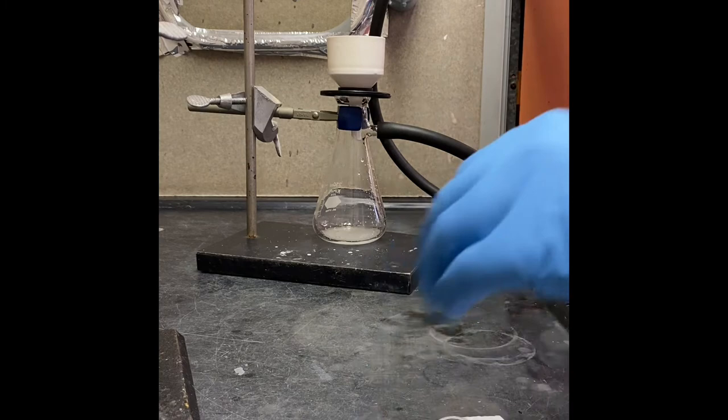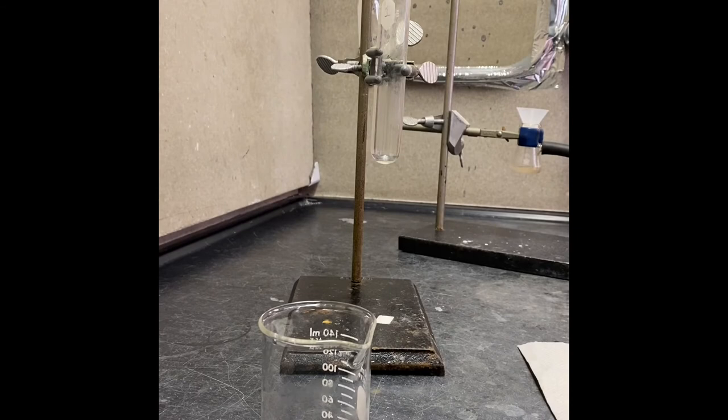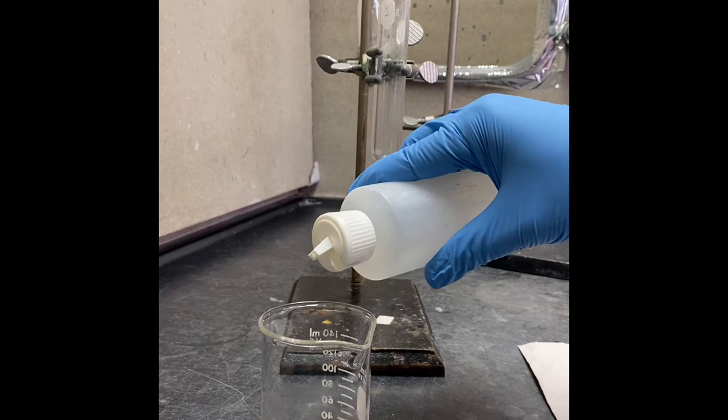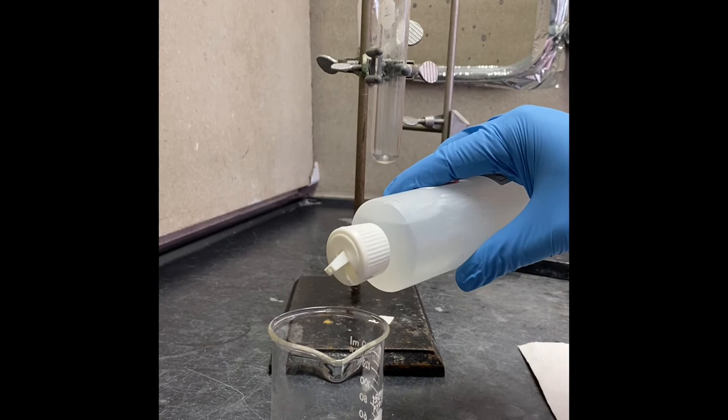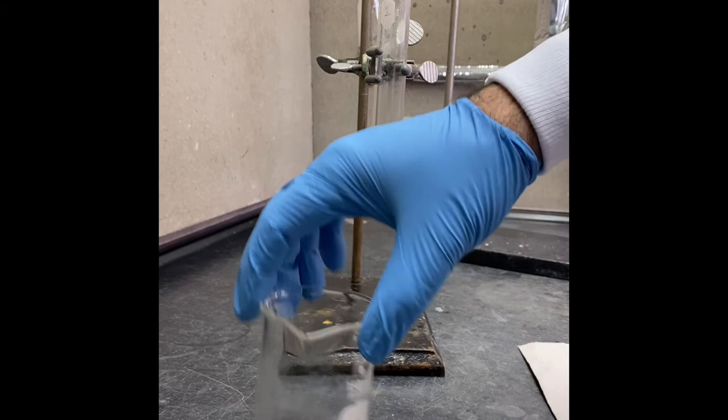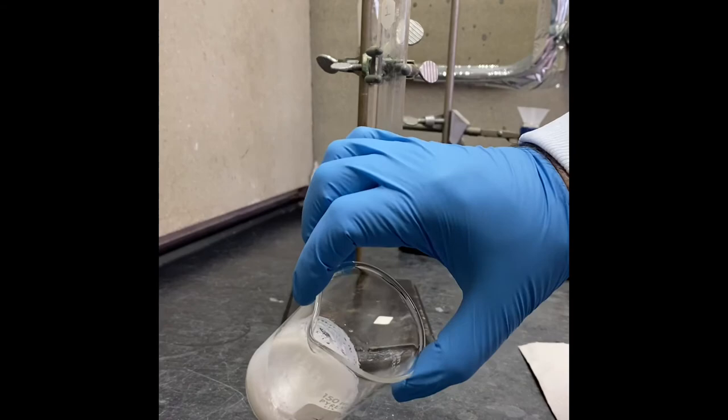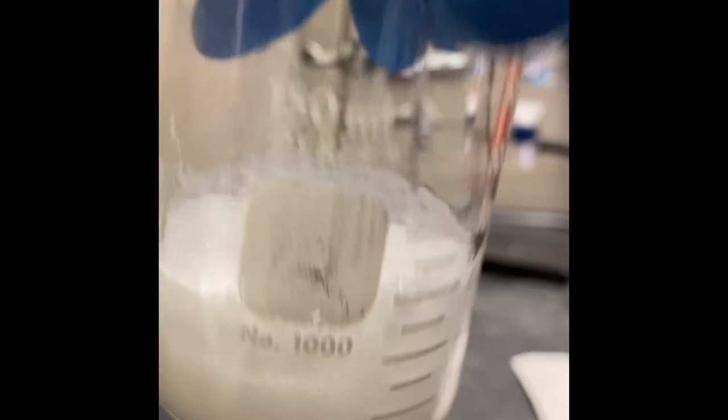I transferred my aqueous layer to the beaker and I'm going to add one molar HCl solution to make that solution acidic, so we're going to get the benzoic acid. As you see, with each drop I'm adding the benzoic acid forms. I'm going to mix that up - it's disappearing because it's still basic. I'll just keep adding. After we add enough amount of the hydrochloric acid one molar, as you see we got our benzoic acid.